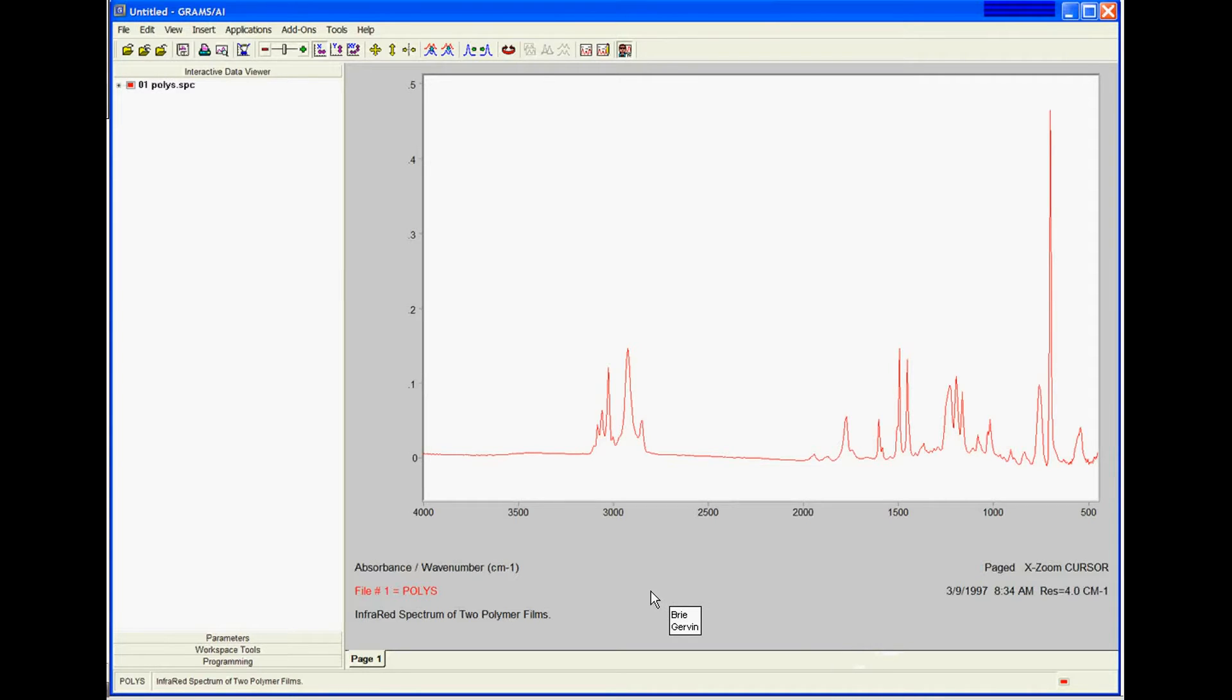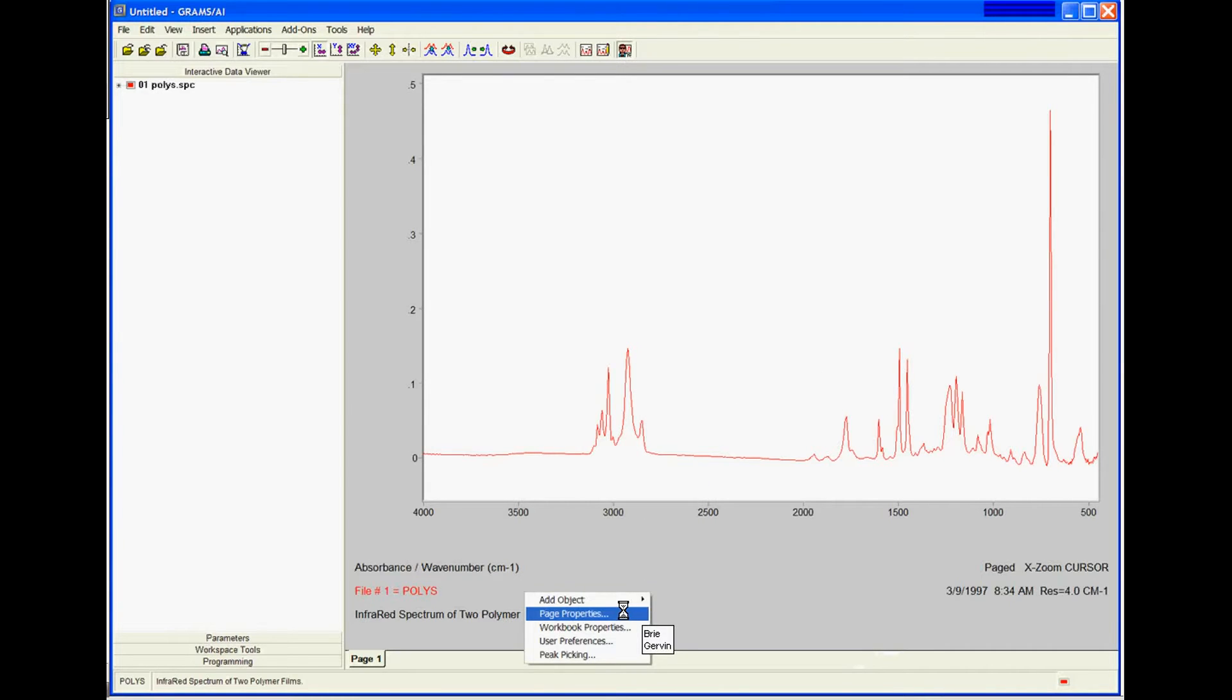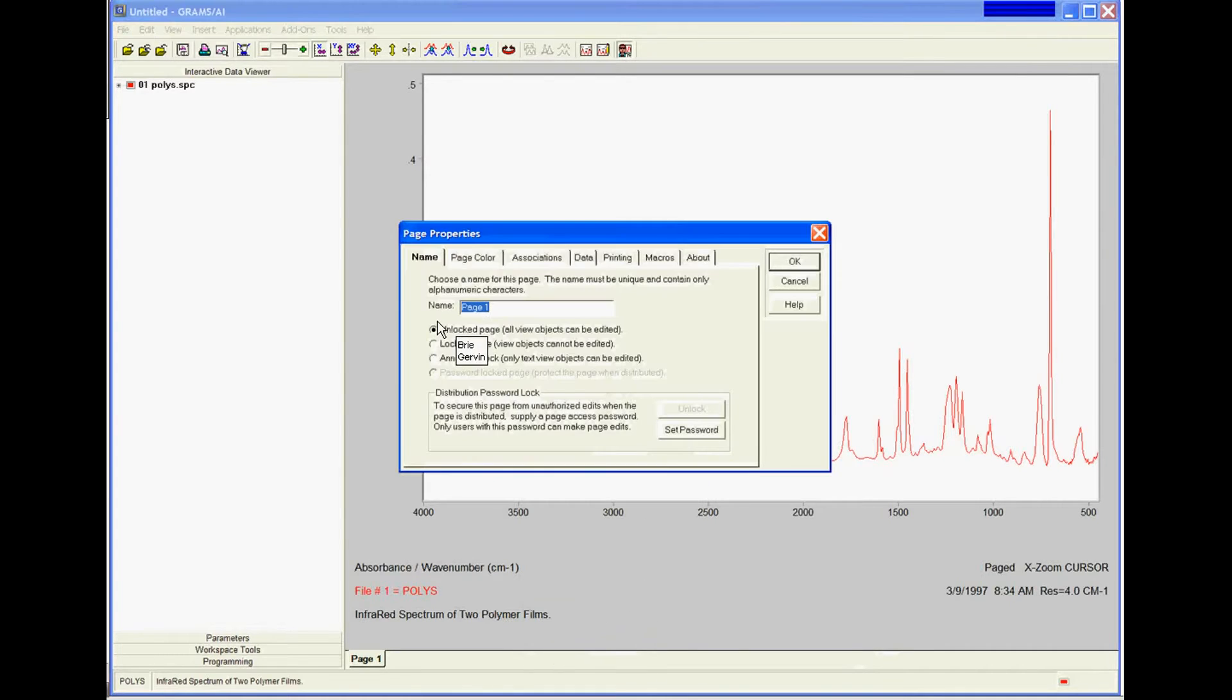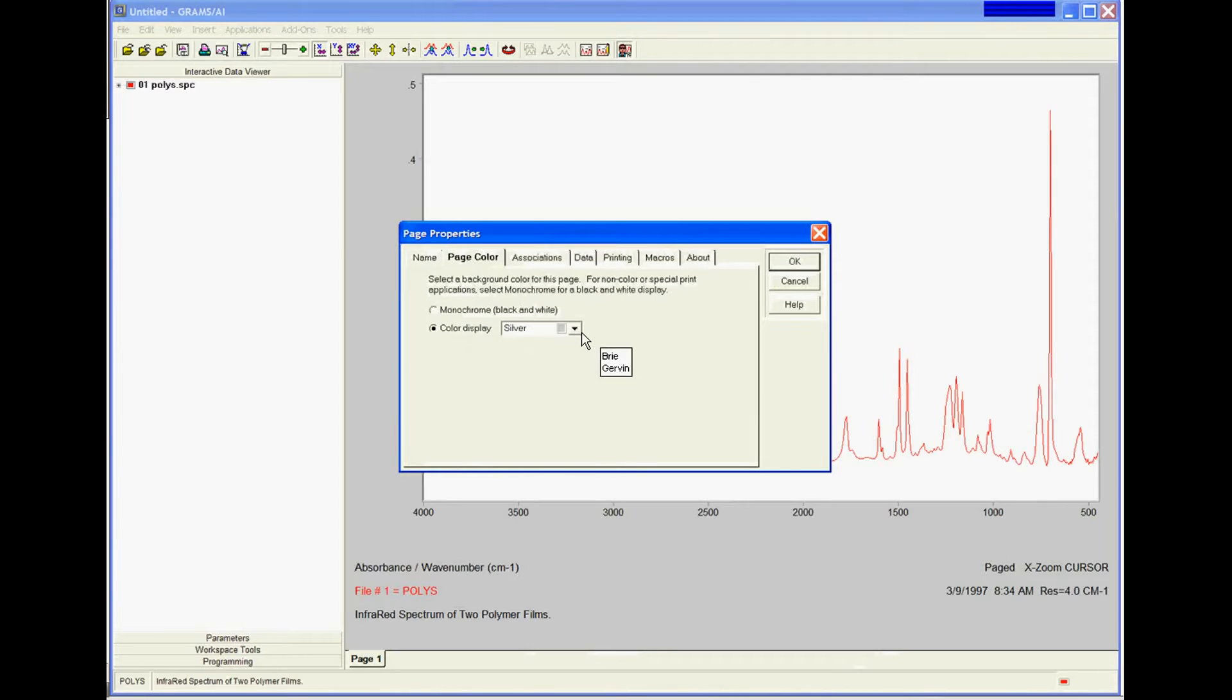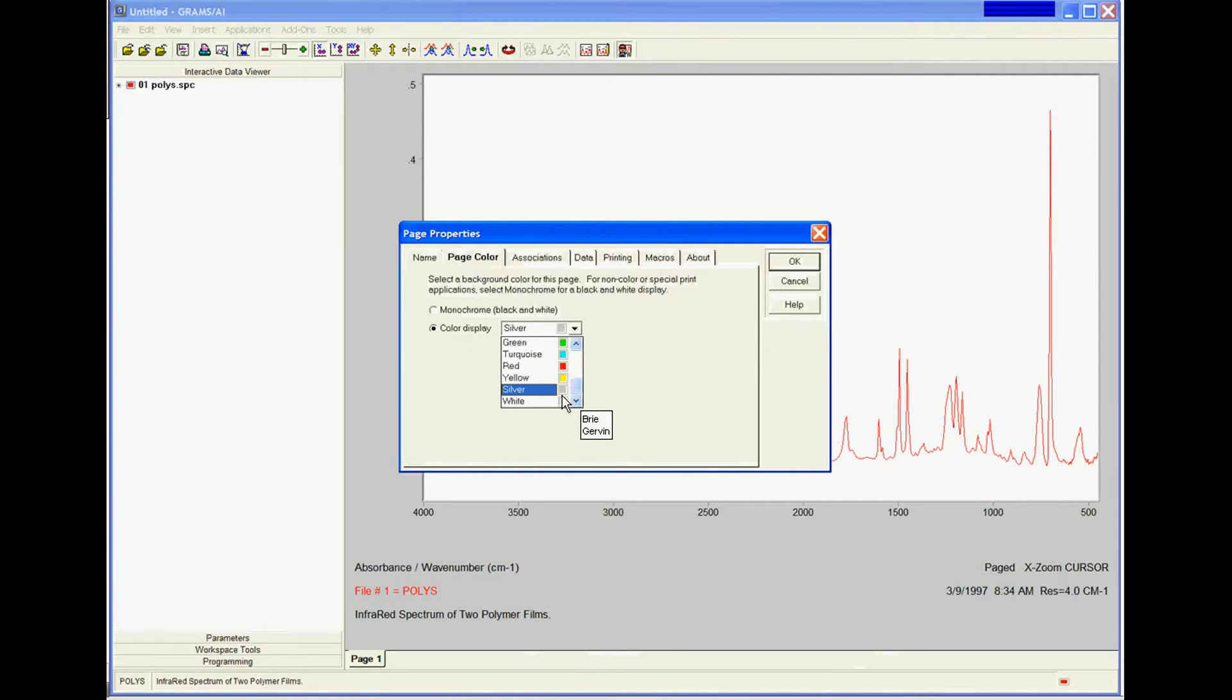I'm going to right-click on the bottom of the page, choose Page Properties and Page Color, and change my color from the default silver over to white.